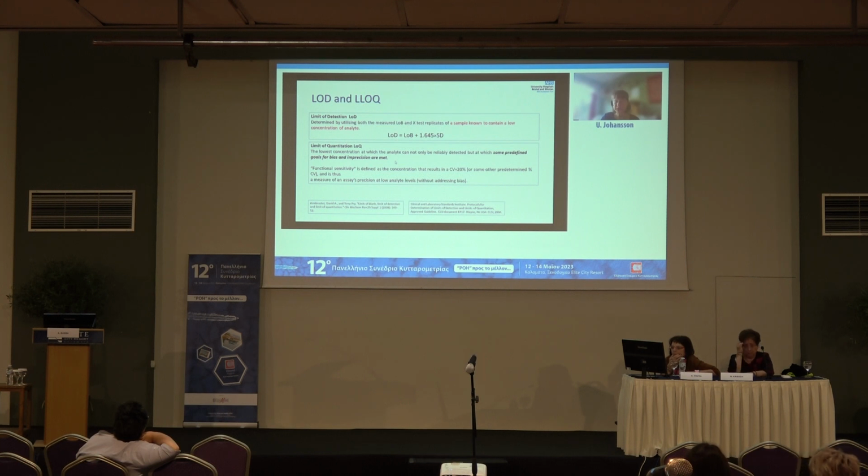So in the H62, the limit of quantification means that you have to spike a sample and actually test your limit of quantification. So to my mind, the H62 treats the LOQ very similar to LOD in some ways.